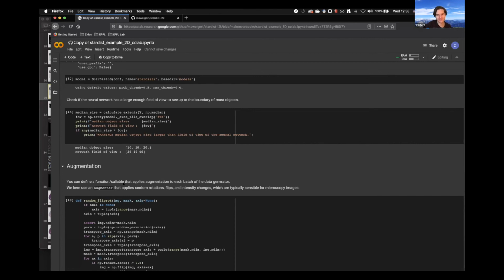But it's super interesting. Or I was even more thinking that if I have multiple labels of objects, and I know that for a particular label, it should look in this channel, like I have a type of cell, and those cells will be marked with the green channel, and then another type of cells will be marked with the yellow channel. So if you want to segment all of those cells, it will just learn which channel is relevant for which.